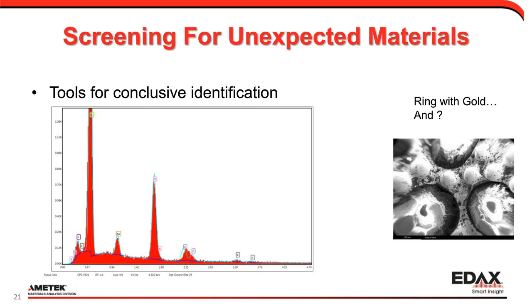And if we identify that peak as sulfur, so the small symbol there is sulfur, hopefully you can see that. So in the center of the sulfur peak, that light blue outline is the model of if this was sulfur, what would it look like? And so if you make an inaccurate identification, our deconvolution line will catch you and alert you to say, hey, that isn't sulfur, that's something else, something is going on there.